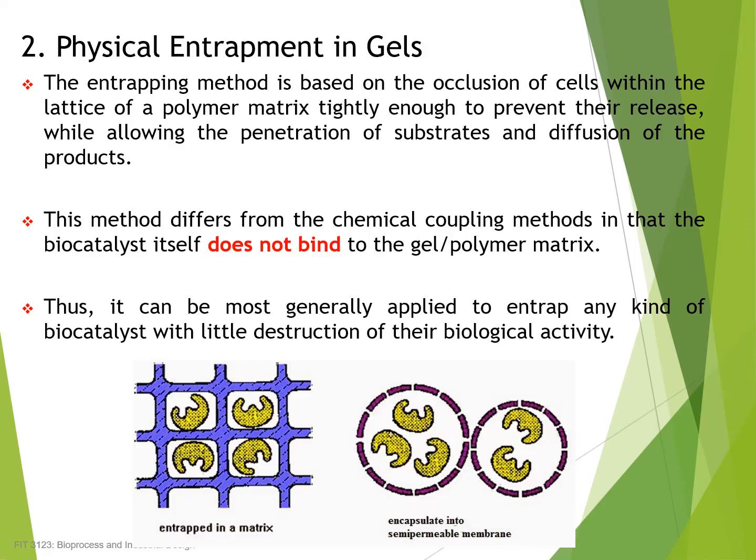It does not bind, so there is no tendency for your cell to be damaged or ruptured or anything. It is only held inside. Same goes to here. This is encapsulated in a semi-permeable membrane.